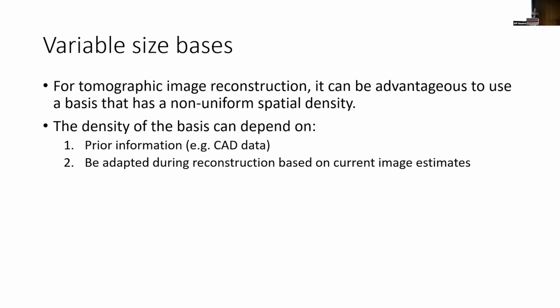Often when we have an object that we want to represent in an X-ray, we're looking at attenuation, and we need a good resolution where edges are, and we might need good resolution in the image where there's something happening. But we might often get away with less high resolution in areas where either the attenuation is uniform or where we're not interested in what we're looking at. And so today I'm going to talk about different ways of achieving that.